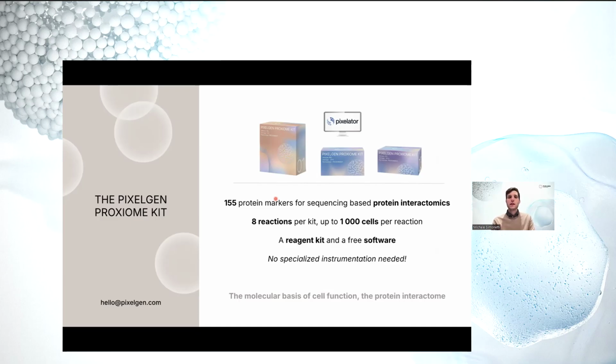It might require a bit of experience running Python or R. But we have a lot of documentation on our website regarding the Pixelator software. You can also download data sets to look at the data and get an idea of how challenging it is to work with them.